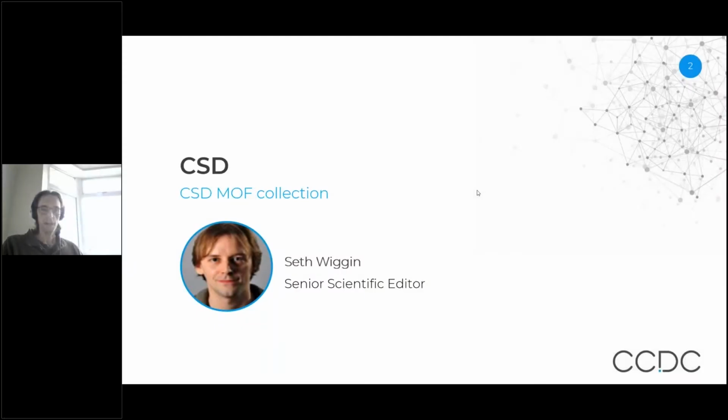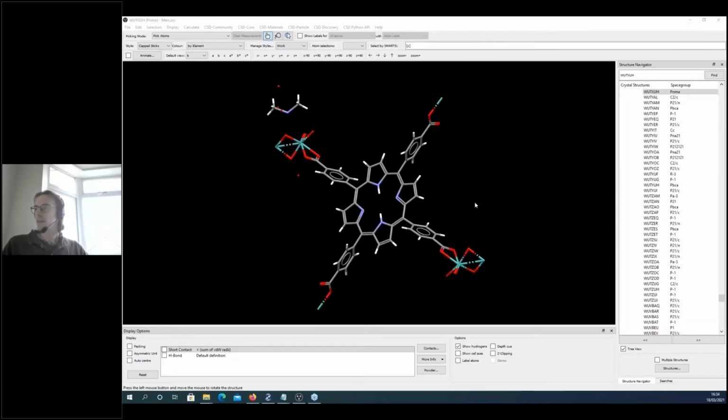Today I'd like to talk to you about the CSD MOF Collection. We released this just a couple of weeks ago as a CSD community feature. So that means it's freely available to download and doesn't require a CSD license for use. So hopefully now you can see my screen with Mercury on it.